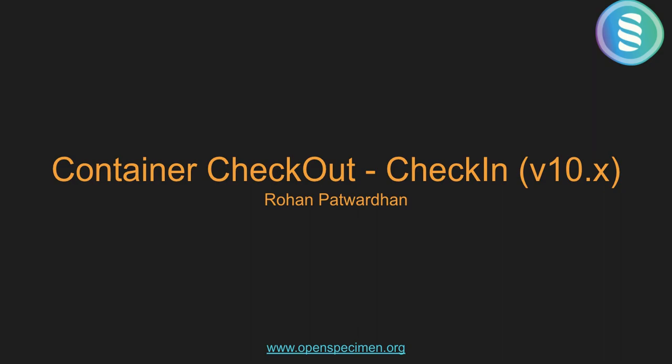Today I am going to demonstrate two new actions supported by OpenSpecimen with version 10.x. They are Container Checkout and Container Check-in.